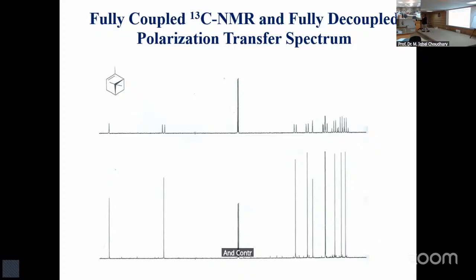You got some information. You got information on which one is CH3 among all 4 types of carbon. Now you can group them together as 2 up, 2 down. And for that, you use the attached proton as an anchor. It's called attached proton.